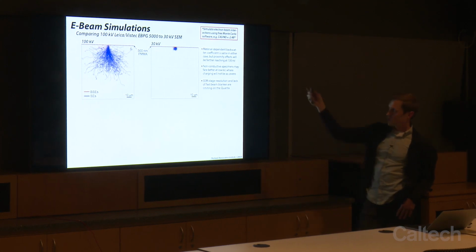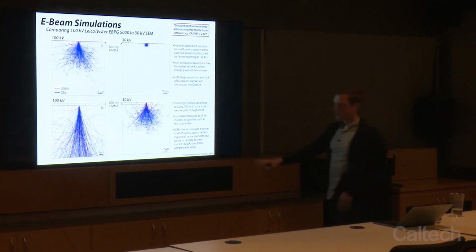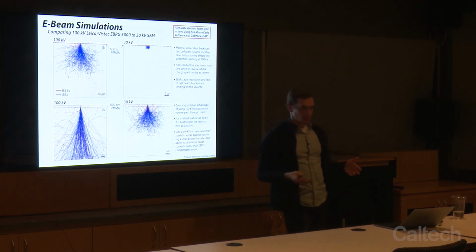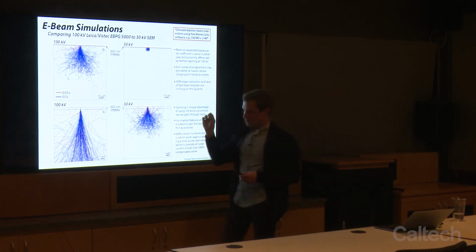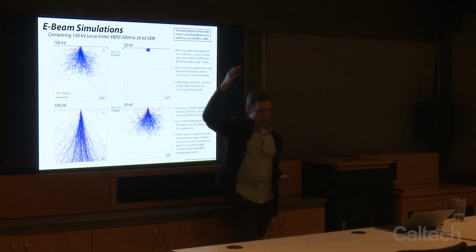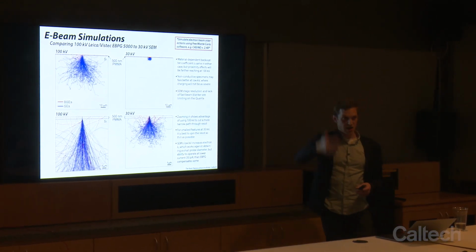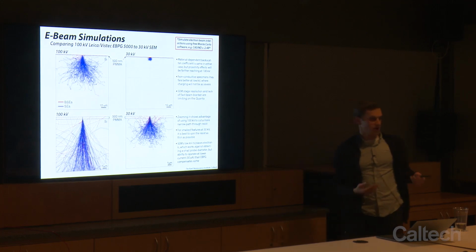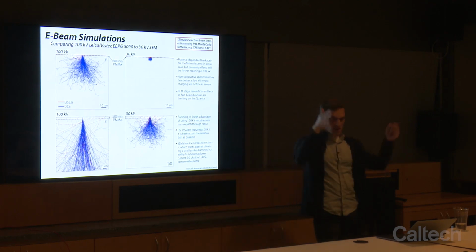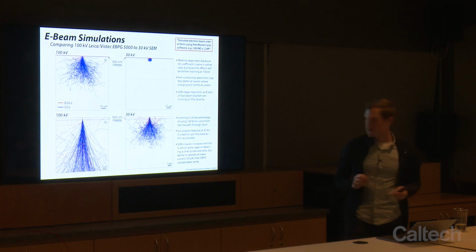But when you're patterning something like a resist layer on the top of your device, what matters is not really how deep the electrons go, but what's happening at the surface. And so if we have even 500 nanometers of polymethyl methacrylate, PMMA, then if we want to know what the resolution will be as we pattern it, we want to look at what's happening up there. So at 100 kV, those electrons are moving faster, we can get a smaller probe size, and they're basically slicing through that PMMA and defining a very narrow path through it. And that's how you're going to get good resolution on your resist. At 30 kV, your electrons already start scattering as they go through that 500 nanometers, and that's going to mean you're going to pattern a wider spot per unit pixel that you're exposing.